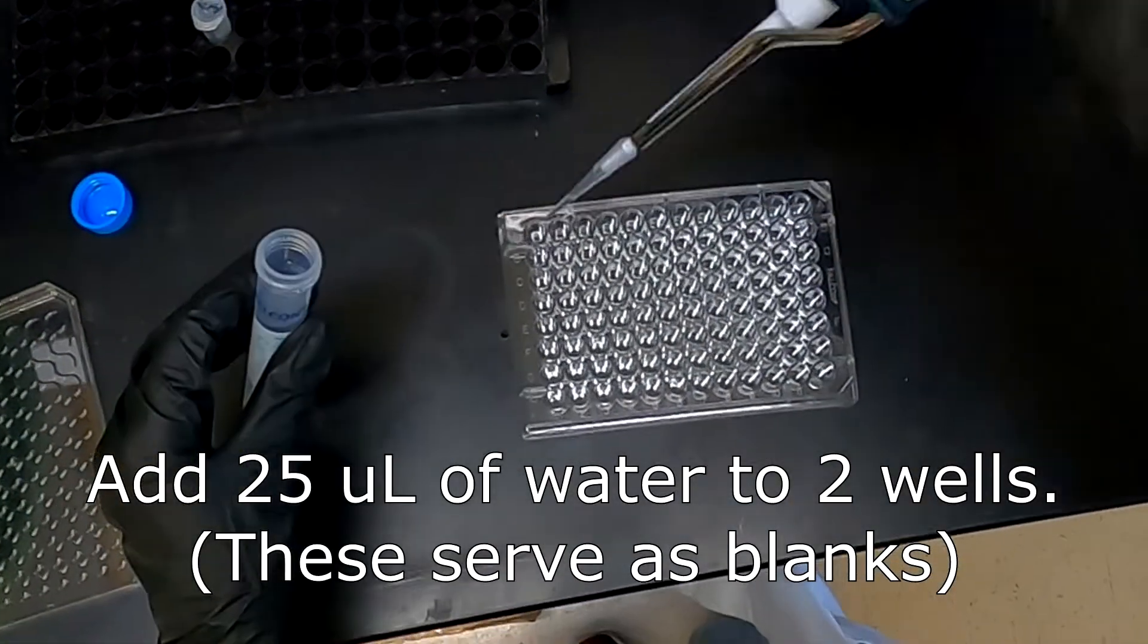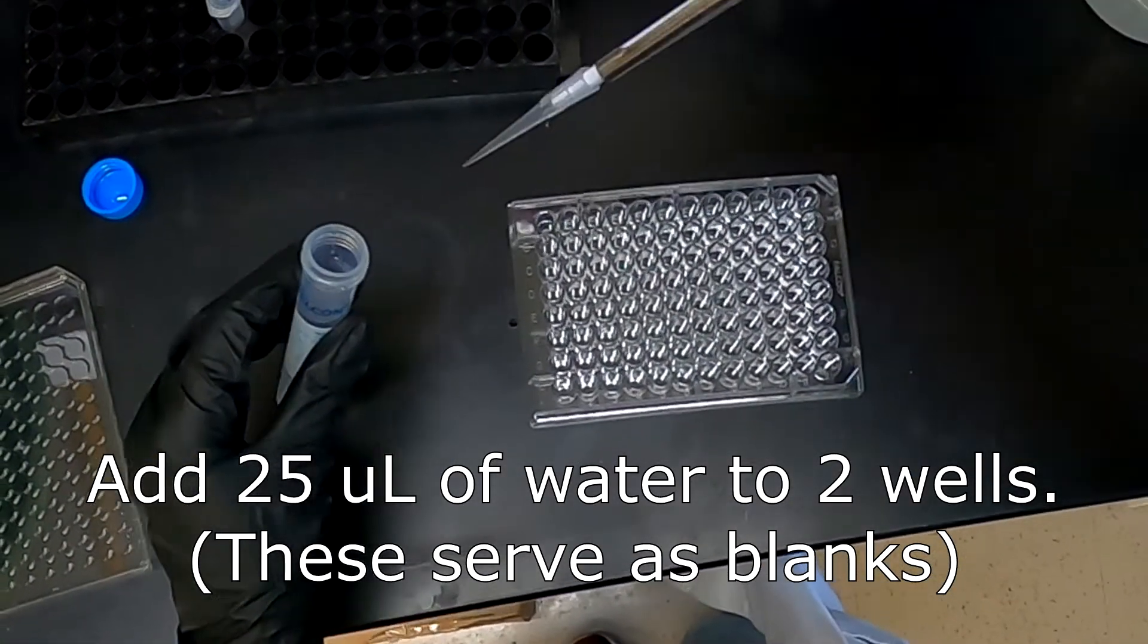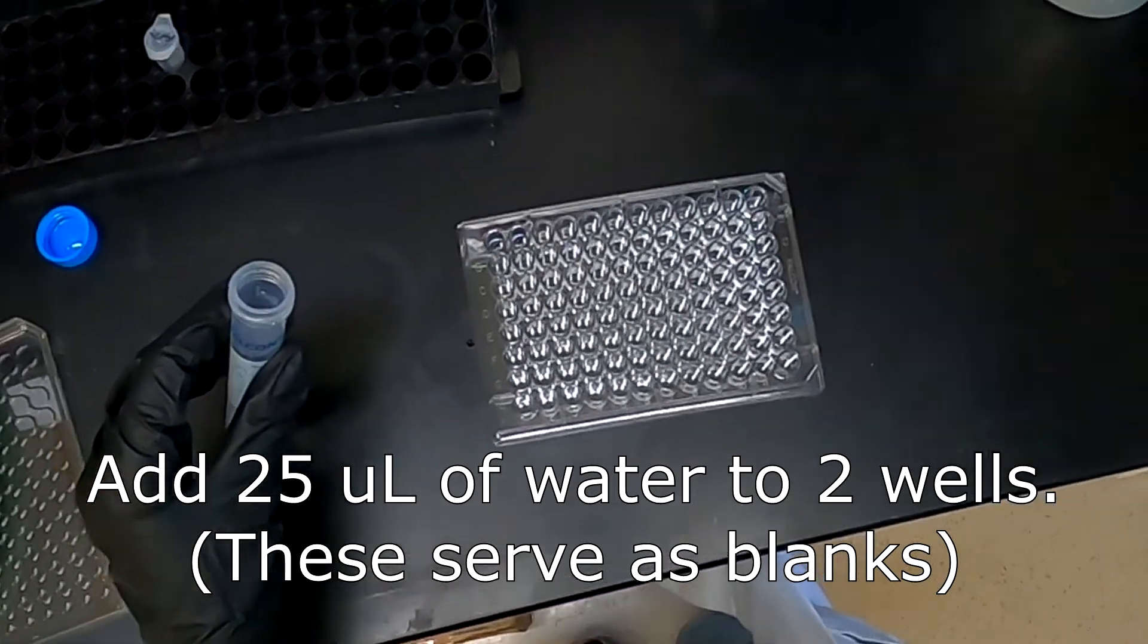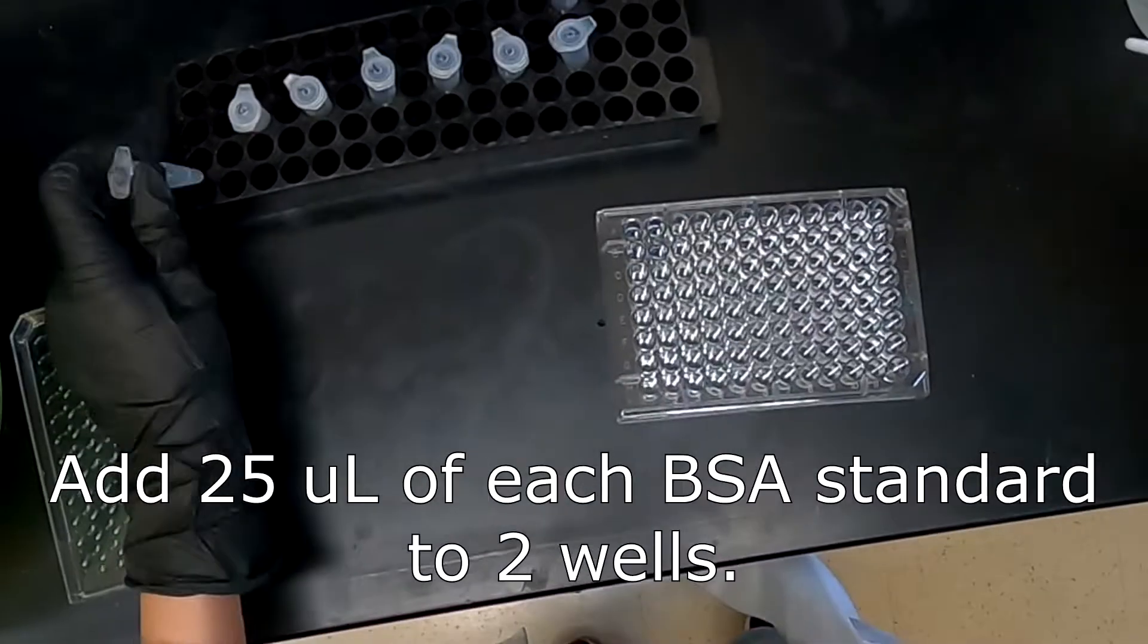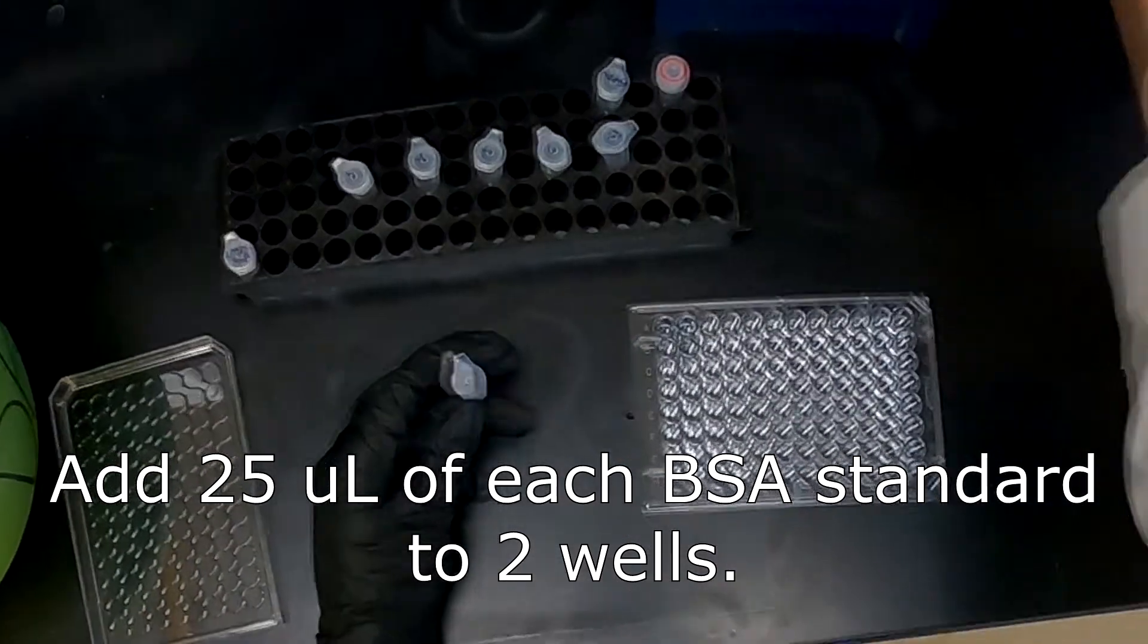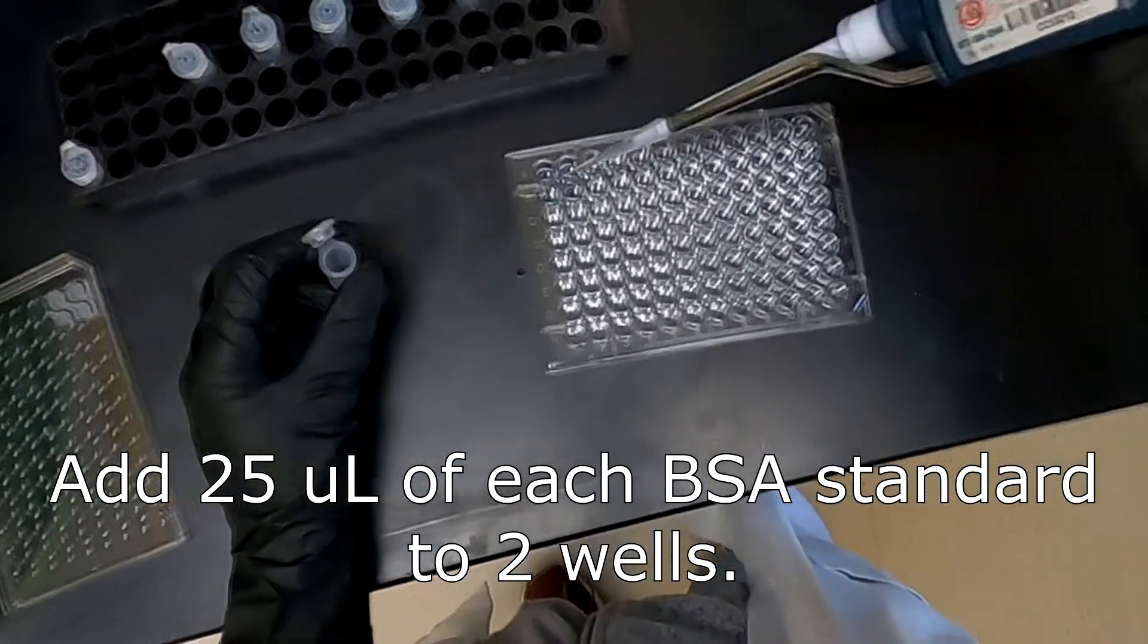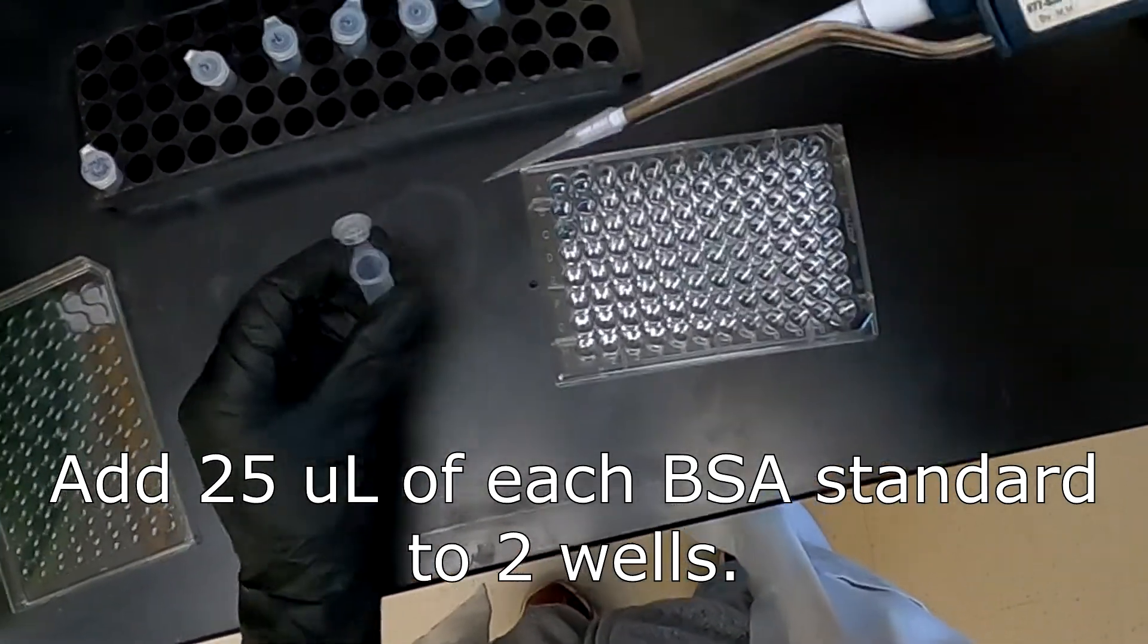25 microliters of water will be placed in duplicate onto the 96 well plate. This serves as a blank for the spectrophotometer. Then 25 microliters of the standards will be added to the 96 well plate, also in duplicates, in order to allow us to average the values.